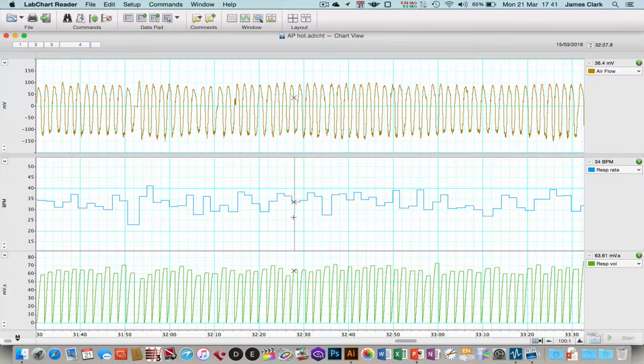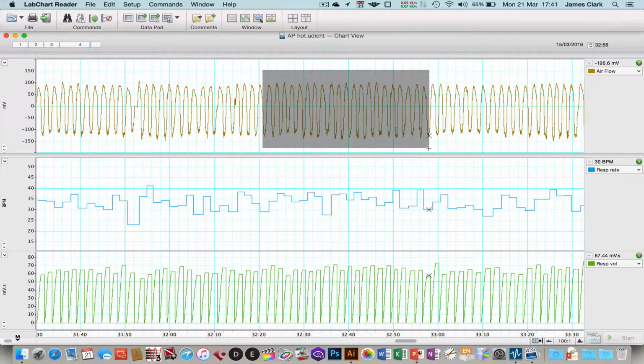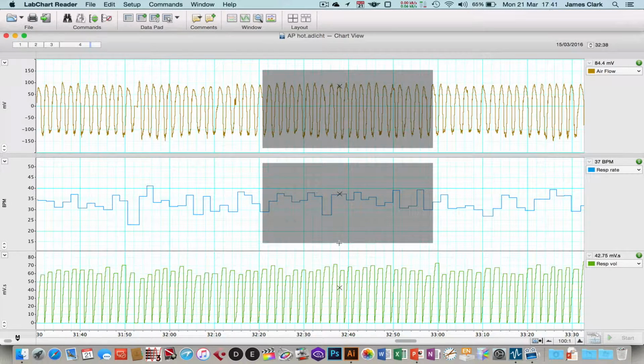You can see I've just selected 3 channels that I want to zoom in on and use for an annotated raw data trace. So just to speed things along, I'm going to highlight, as you would do in any other way, the data I want to select. So I've just highlighted in the top channel the area I want. By pressing the Shift key, I can then highlight the second channel I want, and then by maintaining the Shift button, I can then highlight the third channel.